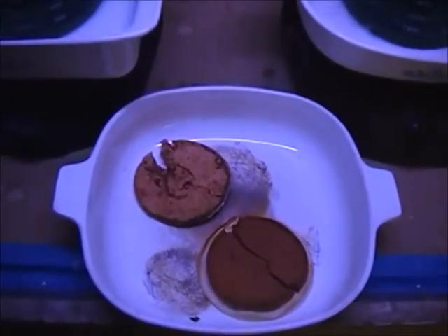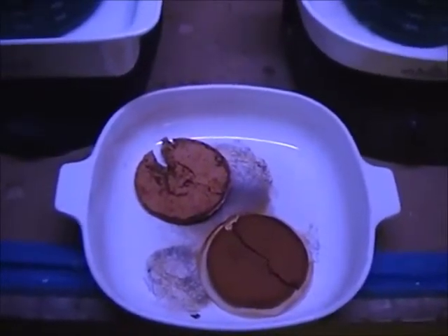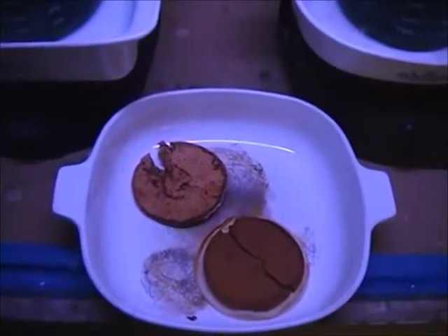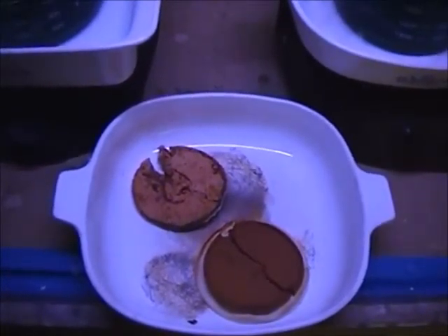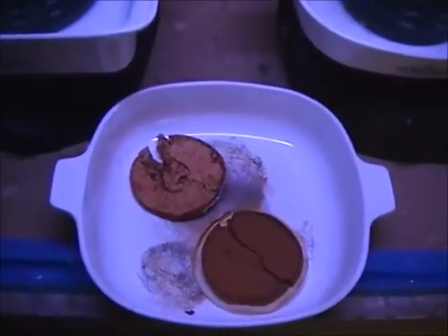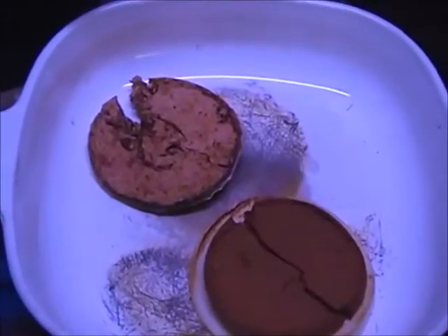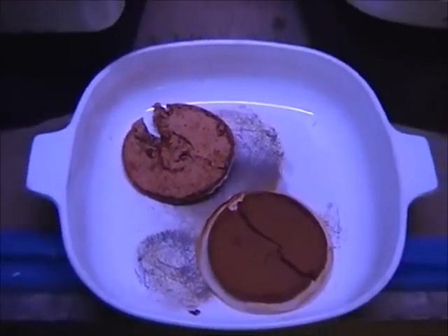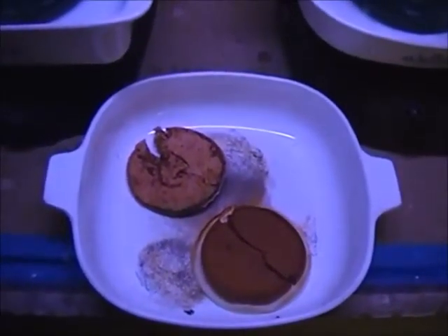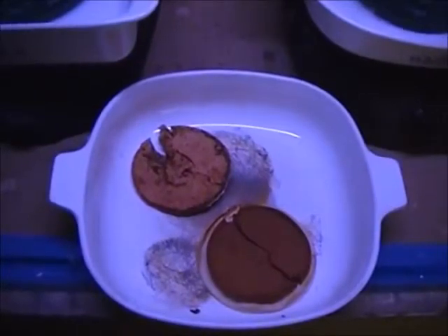But what happens is, just like when we precipitate silver with copper and we get some copper trapped in that silver, whenever I precipitate the copper from the nitrate solution with steel, we wind up with some iron trapped in it. So when I precipitated all this material that we started with, I used that type of copper powder. But in that copper powder is a certain amount of iron or steel, and that's what reported to our filter residues here. Now, after I did the hydroxide step and filtered it the first time, I let it sit overnight and went to filter it again, and I noticed that some more hydroxides had precipitated out of solution.